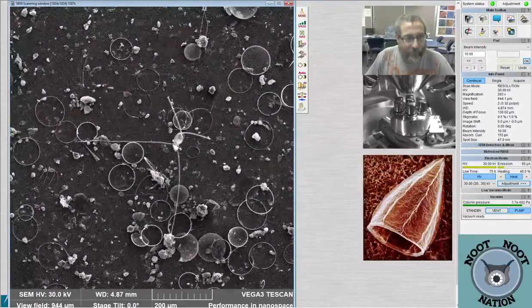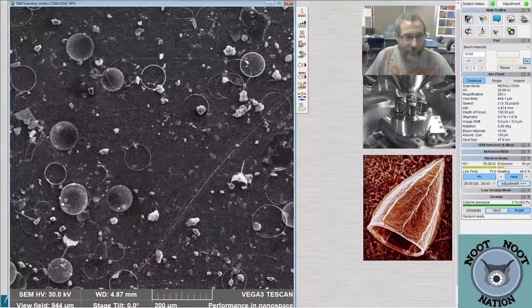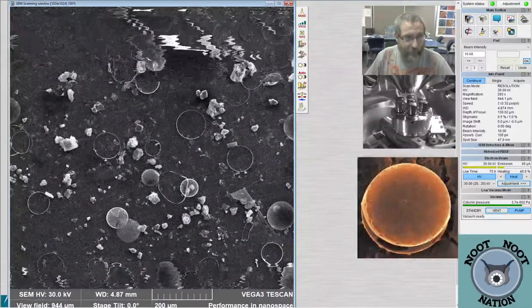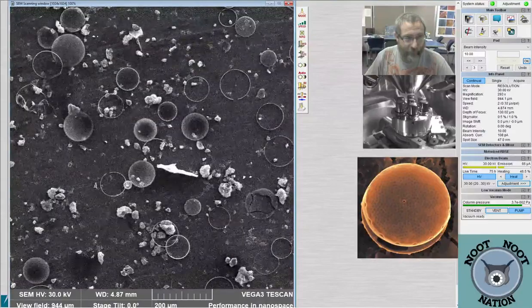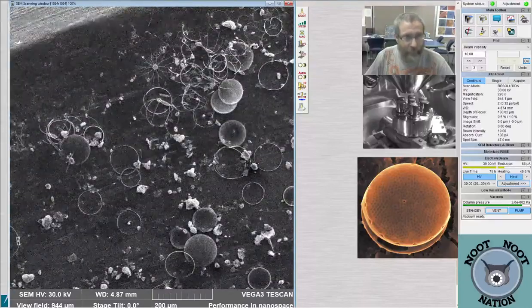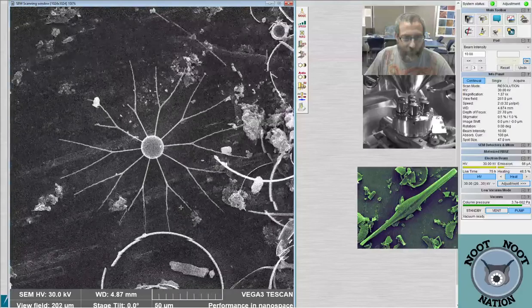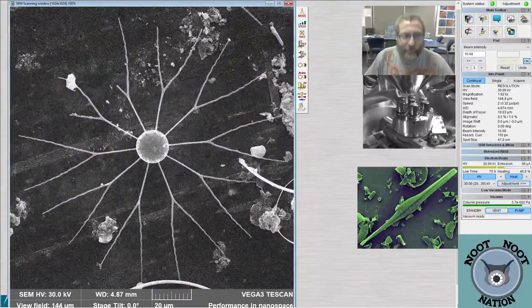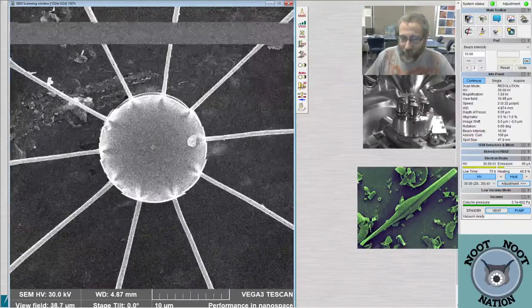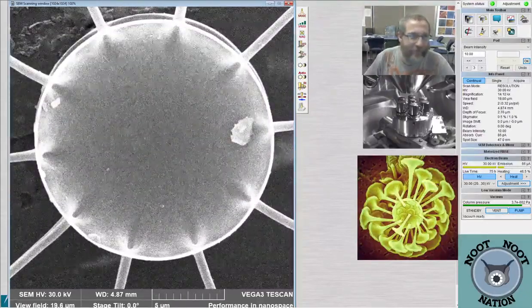Oh, hey, you know what it might be? Hold on. It might be the Thalassiosira bioculata, possibly, because it says a single strutted process precisely in the valve center, a labiate process a little off-centered, and long internal parts of marginal strutted processes is readily seen at a certain focus. Well, that is what it sounds like. Except it shouldn't be in Thalassiosira. So I know. It's been stuck in... Oh, it's an old book. Oh, right. That's probably the issue.